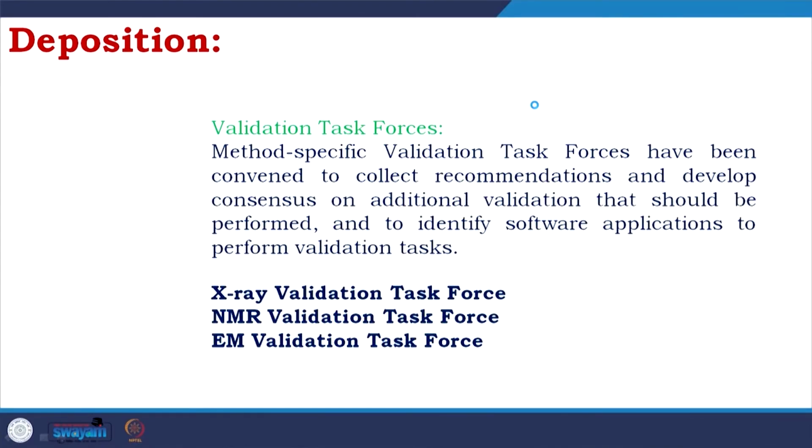So, there are validation task forces: an X-ray validation task force, an NMR validation task force, and an electron microscope validation task force. A crystallographer like me is there in the X-ray validation task force, and an NMR specialist is there in the NMR validation task force. They look at other factors which the automation programs are not able to detect, and they will send you back to improve those factors.